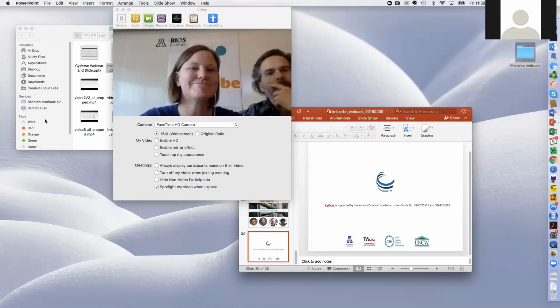So what you can do is run your data through the exact pipeline that we ran, and then your data are much more comparable to other data sets within the platform that we have. And we also hope, as I had said, that using your data store, you're able to bring in data sets that way from CyVerse, or you could also access those data in the near future through these connections with resources such as EBI and NCBI.